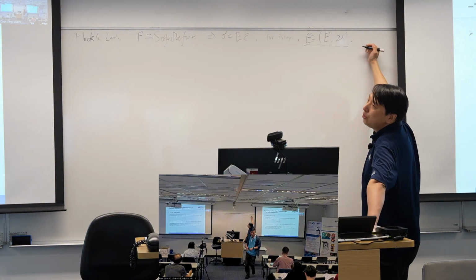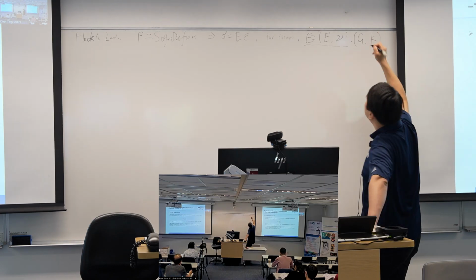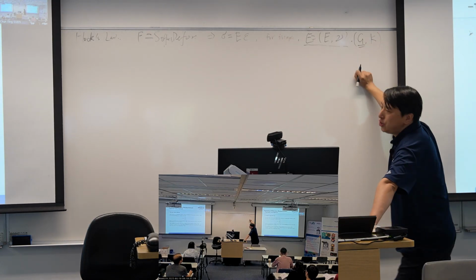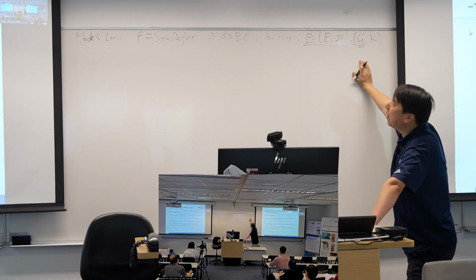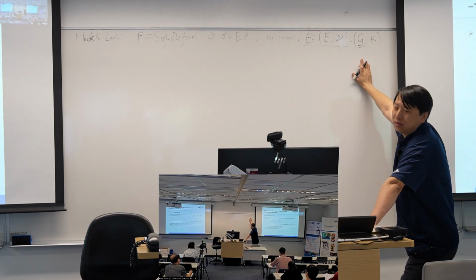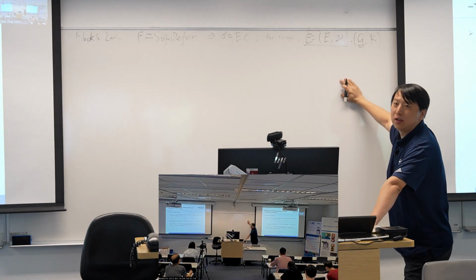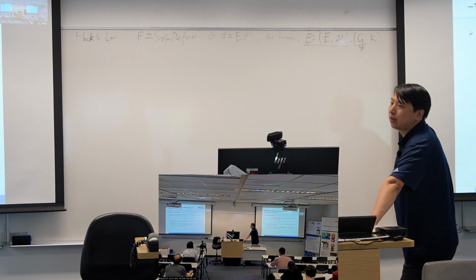We can also use the shear modulus and the bulk modulus to describe it. Especially this shear modulus is widely used in biological materials. So usually when we do measurements for cells and gels, they would use shear modulus.